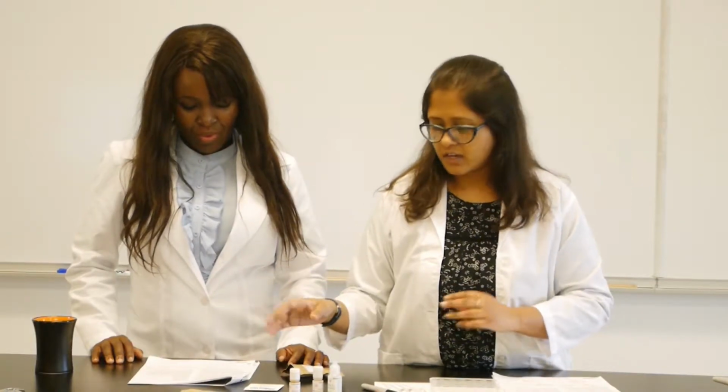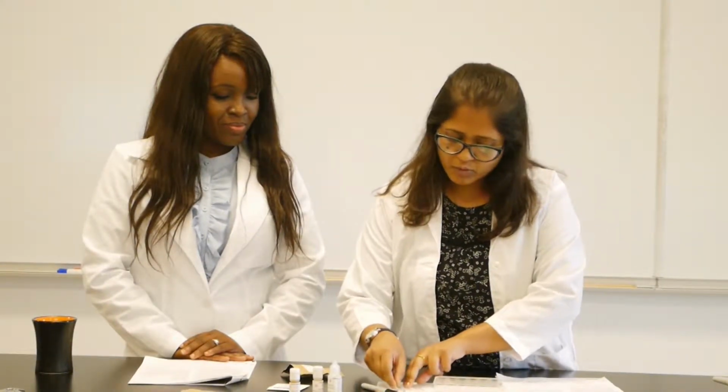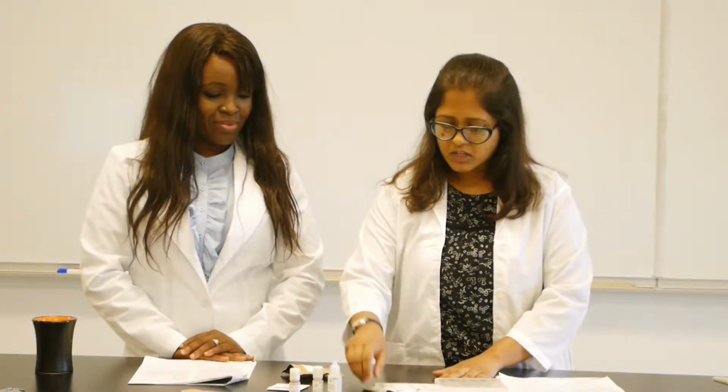Also, to do the qualitative tests, we have pH strips, a well plate, and droppers that we marked so that we don't contaminate when we take the chemical substances. All of these are provided in the kit.